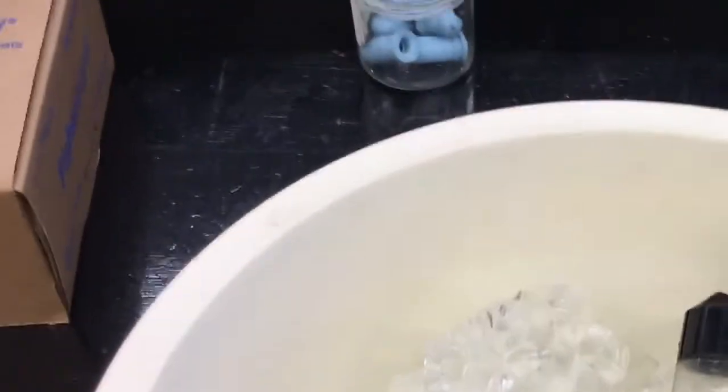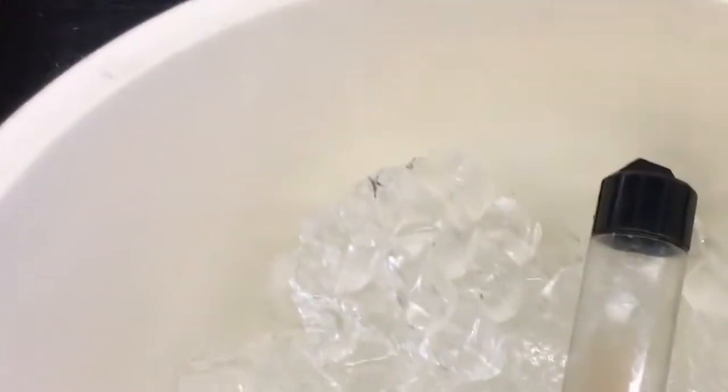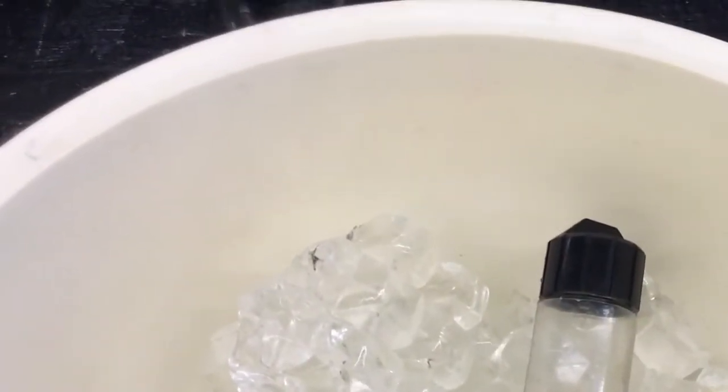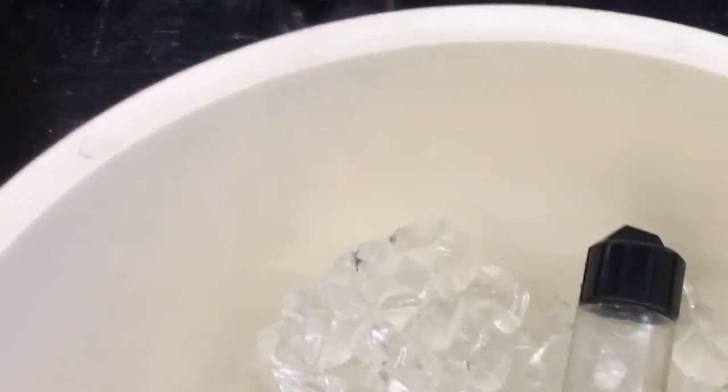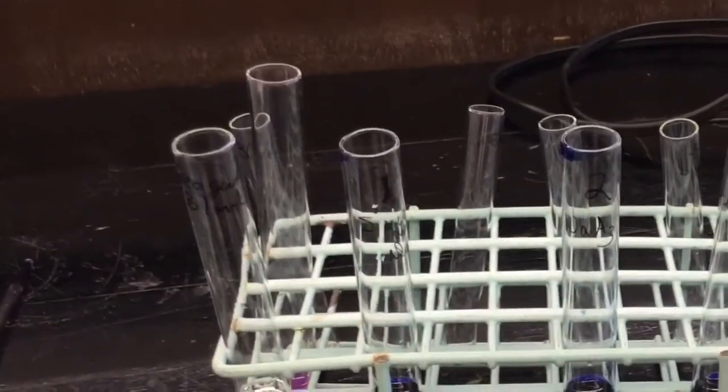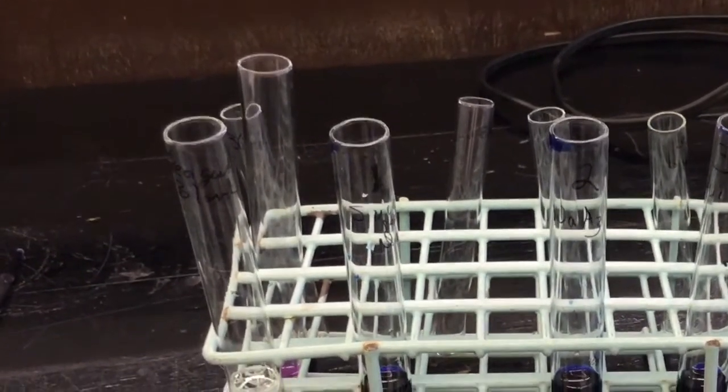I'm now back in the lab. I've extracted the mitochondria from the liver cells, and here's my mitochondrial suspension obtained through differential centrifugation. I've already set up some test tubes with everything in them as the lab document asks, except for the mitochondrial suspensions, which go in one by one as we take readings on the spectrophotometer.